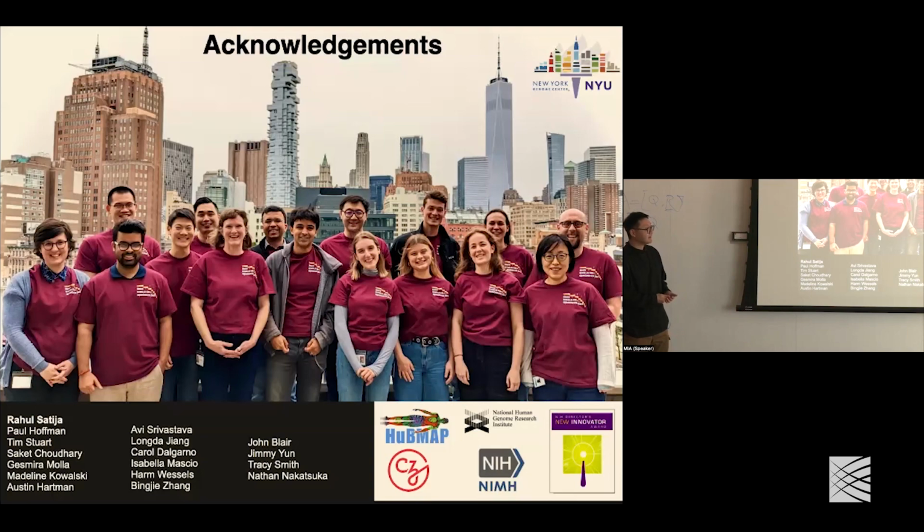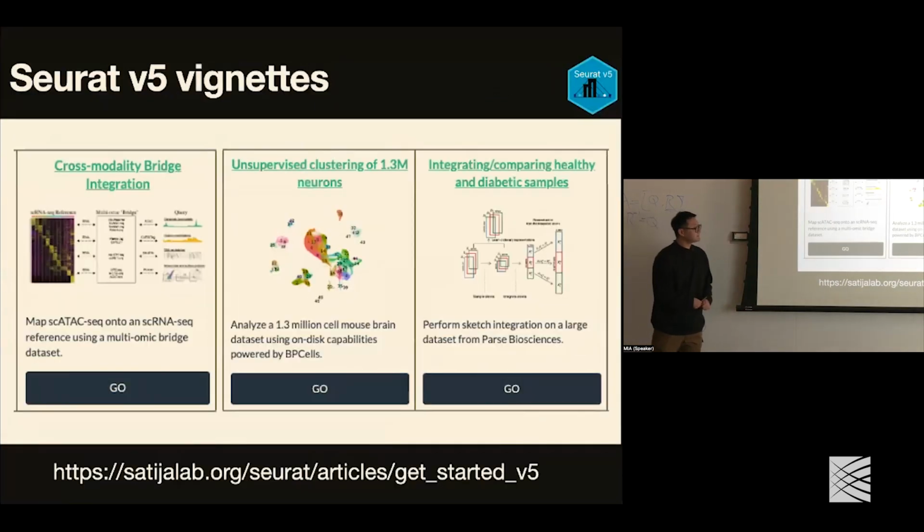I had a question regarding the integration part. When I think about multiome data, I think about how ATAC and RNA are different. Intuitively, given two cells with similar ATAC profiles, they can have different RNA expression profiles because of maybe transcriptional regulation. And I believe Xingyi gave an example where if you just cluster based on ATAC and you just cluster based on RNA, you get different clusters, suggesting that the nearest neighbor graphs on just ATAC versus just RNA are quite different. So my question is, is that a problem when you're computing your bridge cell representation? And how do you know when you've come up with a good enough one to overcome that?